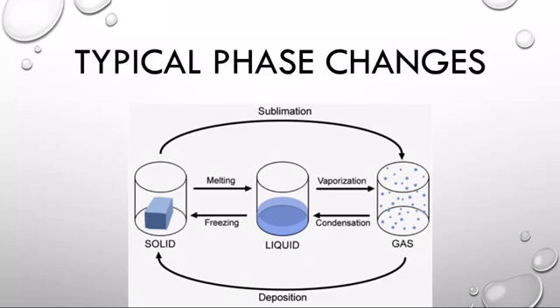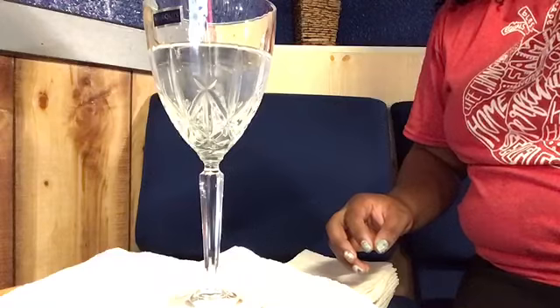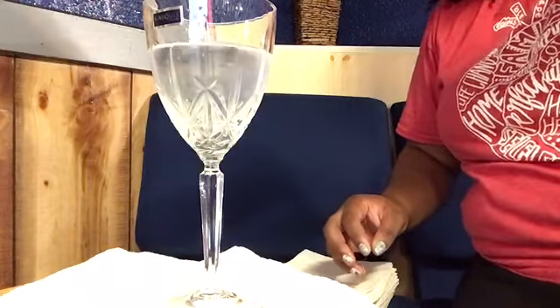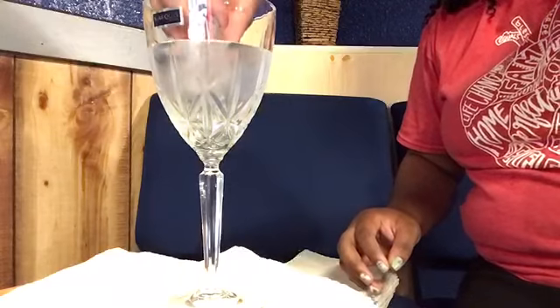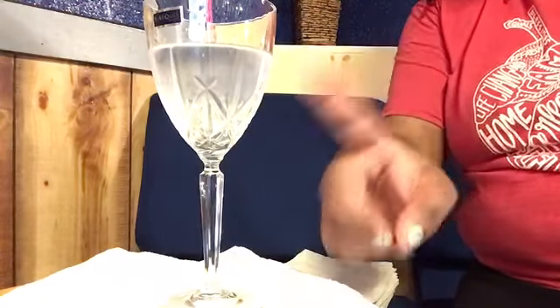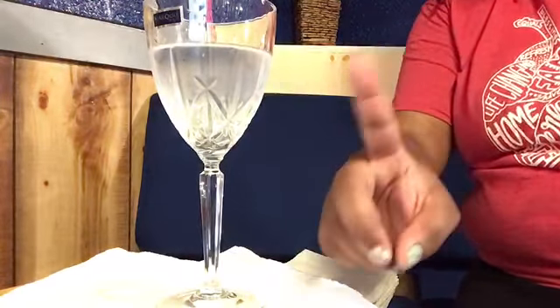Well, as you can see, all of my 3 attempts failed. But hey, that's part of chemistry, trial and error, right? So, for this experiment, I did have to freeze my water 2 times for 2 hours and 30 minutes. And I think that was the problem. Maybe it needed to freeze a little bit longer.